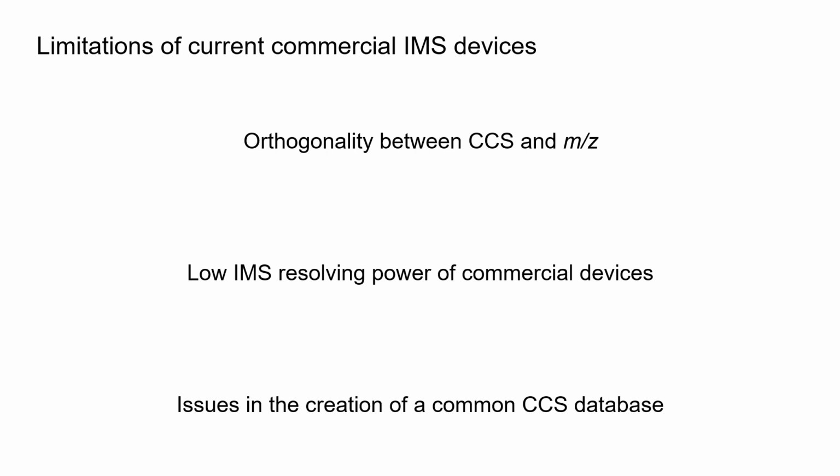And I have to say there are limitations in terms of mass to charge dependence and poor resolution of current commercial systems, but IMS can bring a real advantage also in small molecule identification, not only by the use of CCS, but also thanks to the reduction of background noise and interfering peaks in the low energy spectra and fragmentation spectra in data independent acquisition.